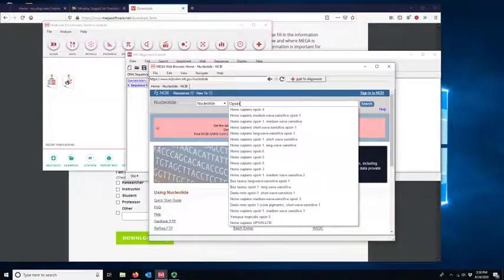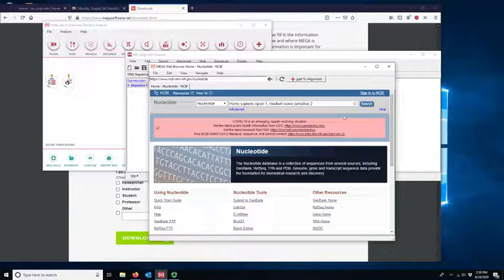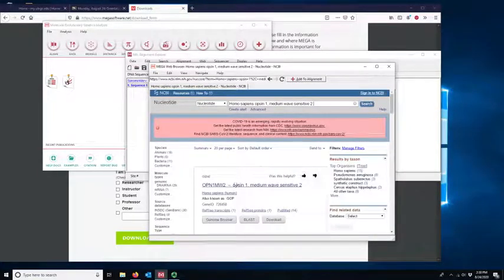Okay, opsin is a type of gene that is involved in light perception, and different organisms have different types of opsins. So let's say we wanted to study the evolution of opsin number 1 across a group of mammals. And again, depending on your interest, you might choose a different gene, or you might choose a smaller or a wider range of organisms to study.